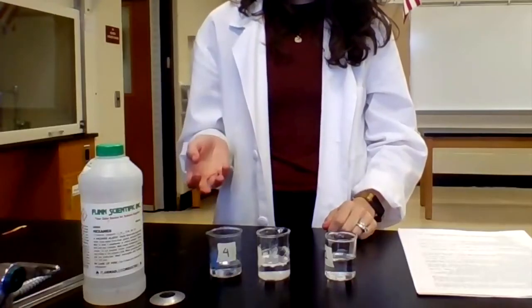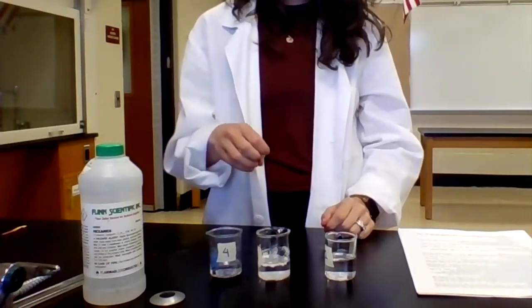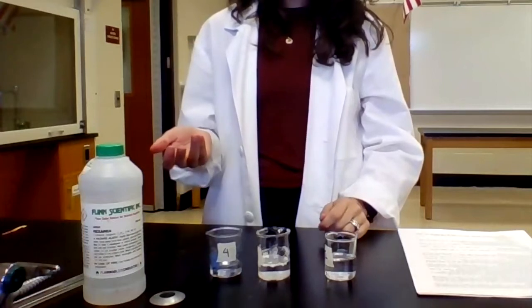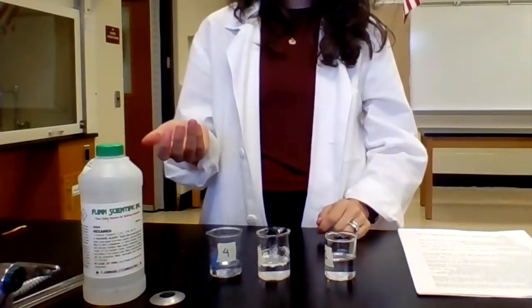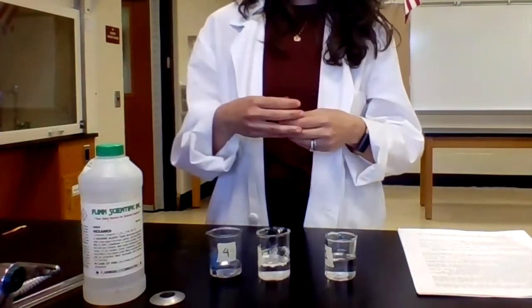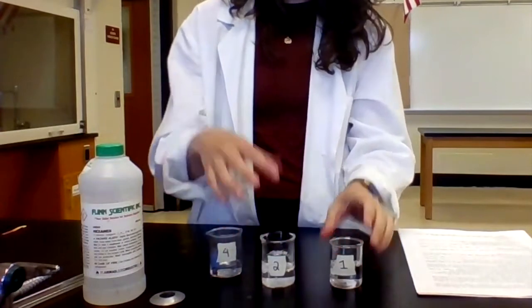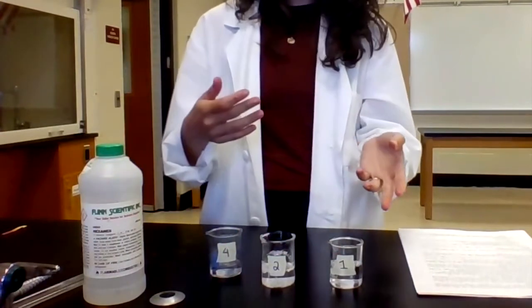One of the last properties that we want to test is solubility. So we know that nonpolar covalent compounds shouldn't be soluble in water, since water would be a polar solvent, but polar covalent as well as ionic solids should dissolve in water. So we can use the same beakers that we were using to test conductivity, since we added water to them.